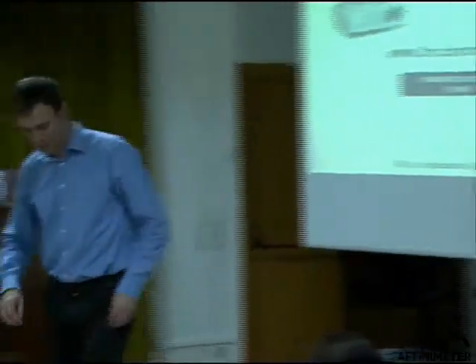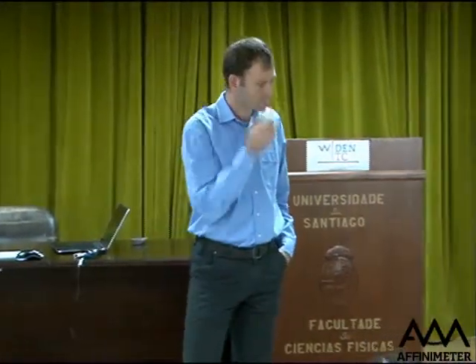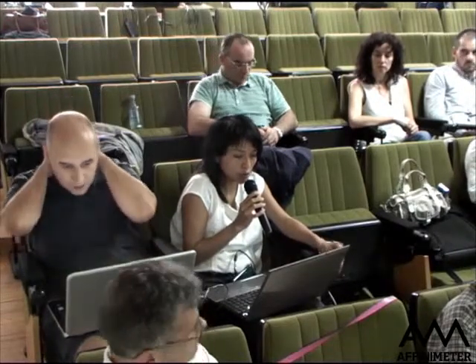This is another question of Geoff Holtgate from AstraZeneca. He comments, we have seen several different analysis approaches already today. Should academics and instrument providers work more closely together to provide better solutions for complex data analysis? For example, the complex models you describe as well as WIDEN-ITC and NITPIC.